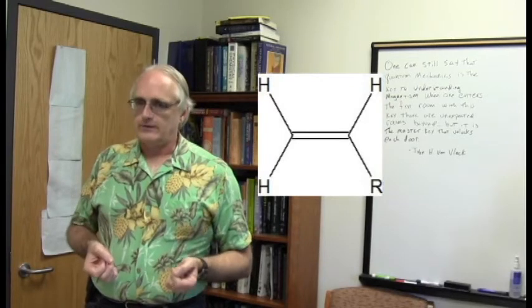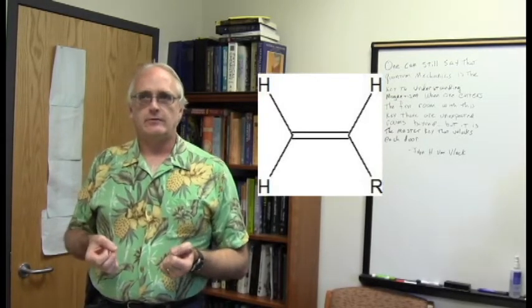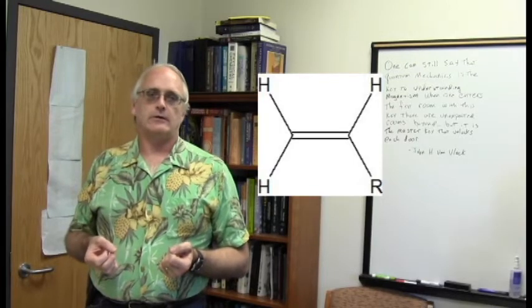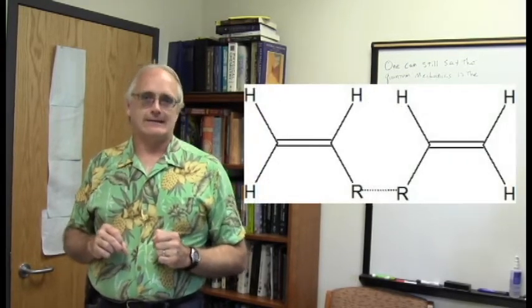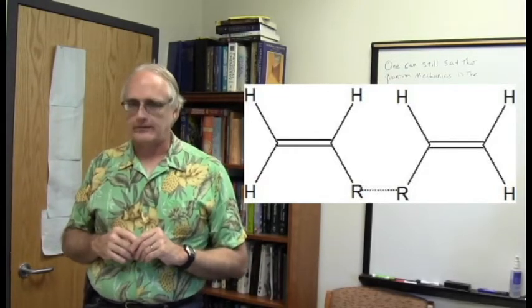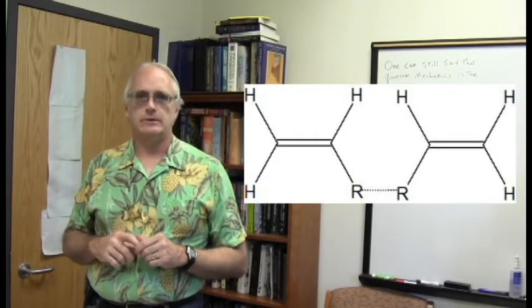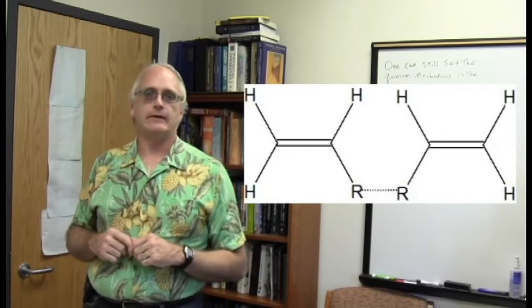But we see CH2s, an indication of symmetry. I wonder if this molecule actually has 2 of these terminal alkenes in it, and it would have a structural feature that would look something like this with other stuff in the middle. That'd be kind of cool. Well, keep that in mind as well.